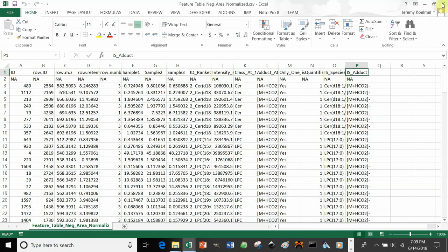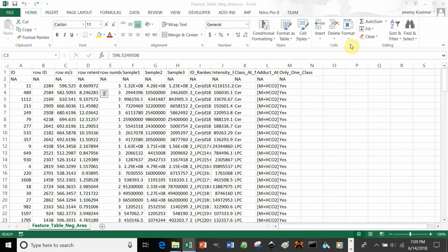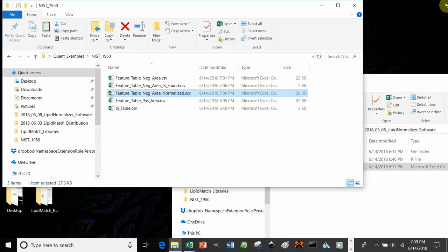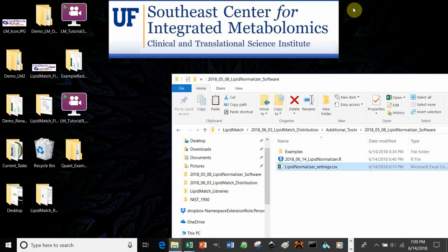After normalization, you can look at the statistics video using MetaboAnalyst to continue your workflow.